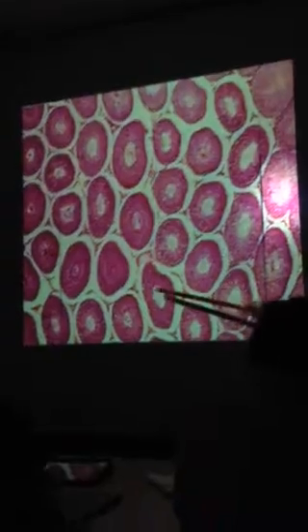What is this? What organ? Testes. That's the testes. So what are those? The seminiferous tubules, and then what are little things in between this triangular area right there? That's the interstitial tissue that makes up the what? Testosterone. Okay?